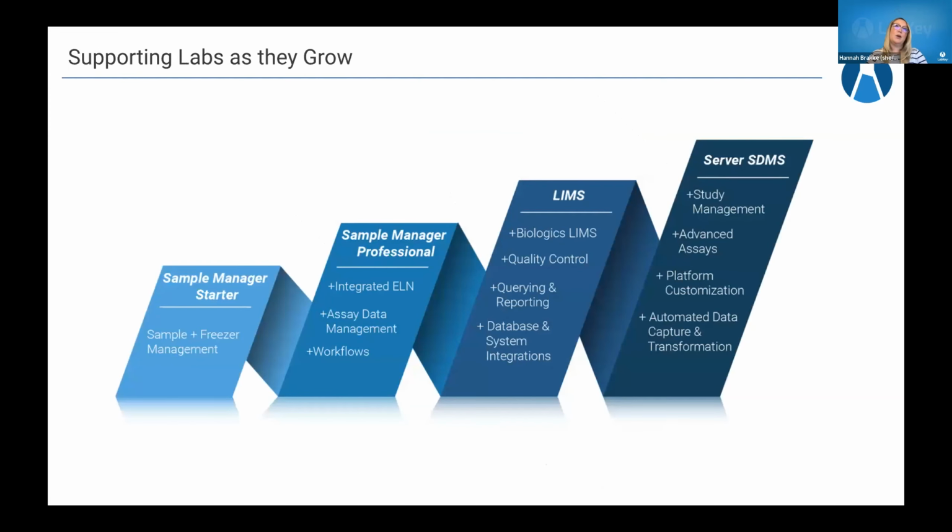And as Michael mentioned, we really are trying to support labs as they grow too. Most of our folks coming in are really only wanting to address the current pain points, which is oftentimes their freezer management solutions. So providing different options for labs, depending where they are in this modernization cycle, has been really important to us. And so the Sample Manager Starter offering really focuses on that sample tracking and freezer management component.